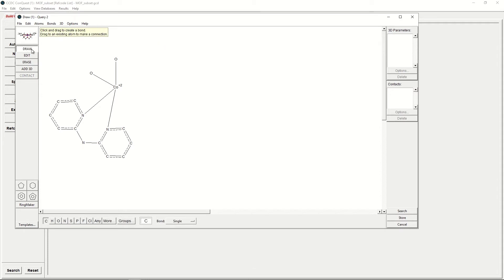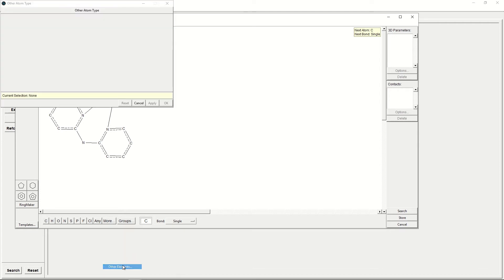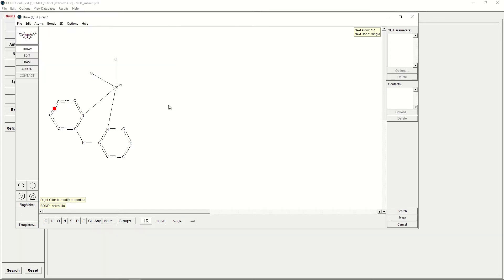Secondly, we would like to broaden our search to any first-row transition metal as a core of any charge. To do this, we will start by clicking More, Other Elements, and 1R. This will mean that any first-row transition metal will be selected. We will then tick OK.